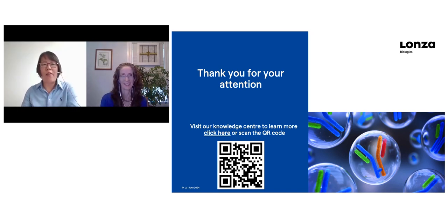Thanks, Janice. Thanks, everyone. That's a great question. So same vectors are used for both to offer extra flexibility for your development work. For the second follow-up question, for stable pools, mRNA piggyback is used, and for transient transfection for our GS discovery offering, the piggyback is used as PTGE23 plasmid. We would like the GS discovery to be as robust as possible, so plasmid PTGE23 is used as it's easier to handle and it's easier for you to use in your lab.